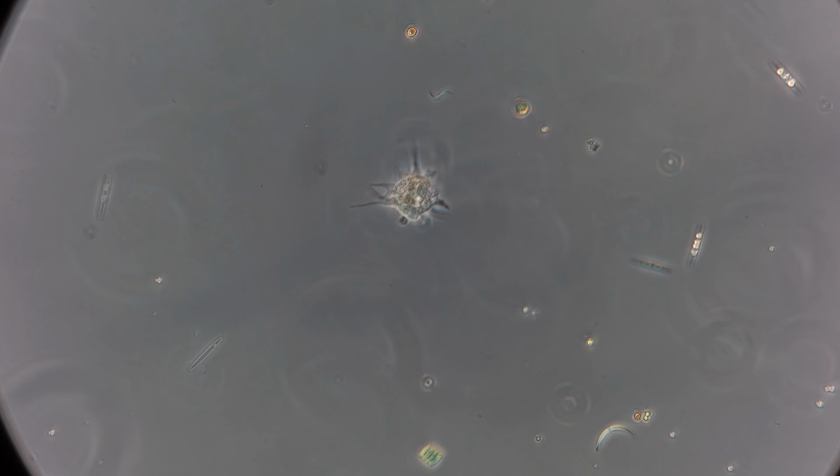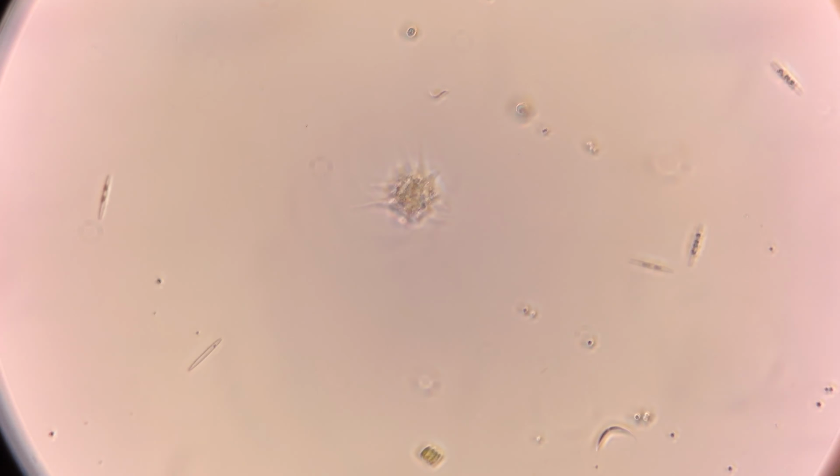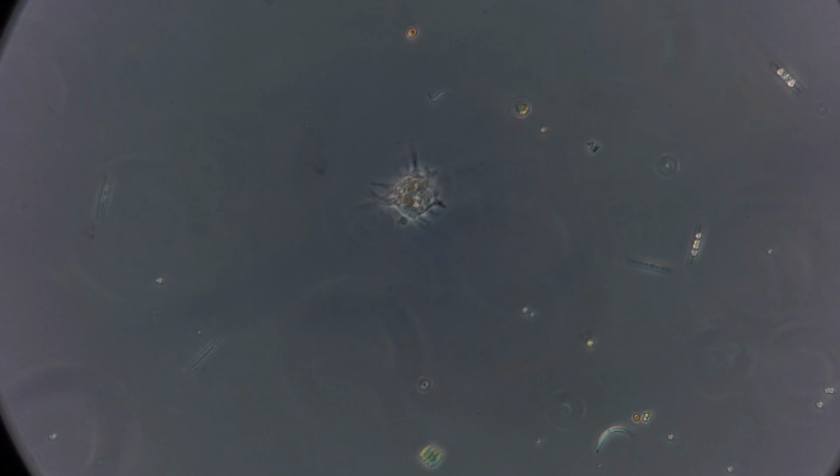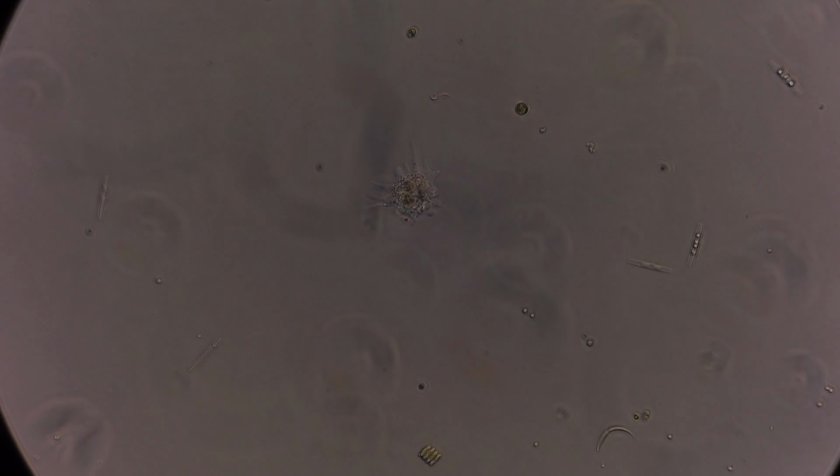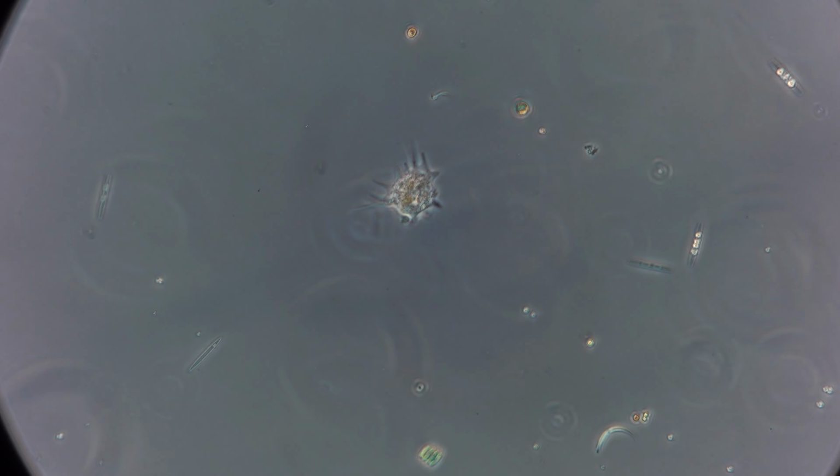Oh, is that where it only highlights the things that are moving? It's more just a different type of light. So this is called phase contrast, and it adds contrast to the membranes. Normally this would just be kind of boring, but the phase kind of makes it cool.